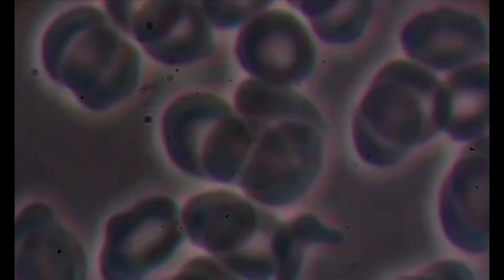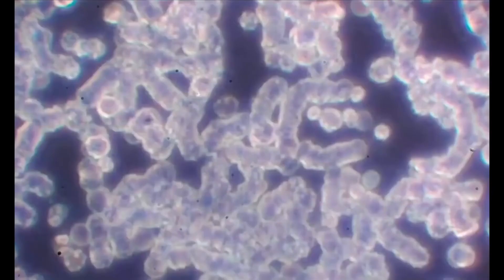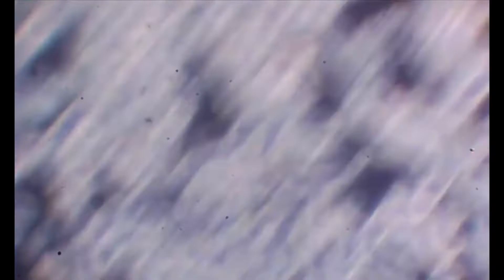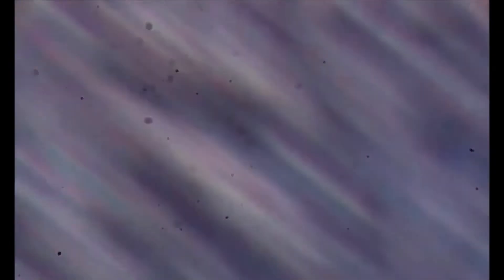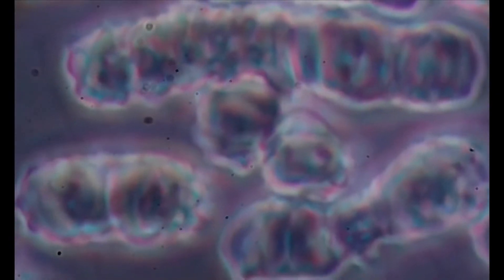So that means that this immune system is active and working. This is vaccinated blood. As you can see, all the blood is stuck together. You see that the blood cells look really strange - they have these really weird shapes.